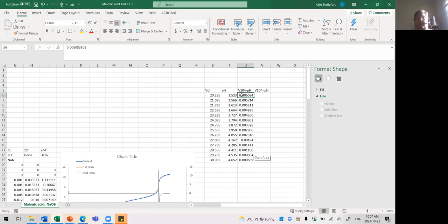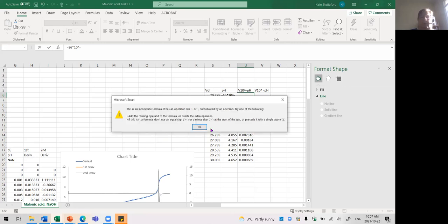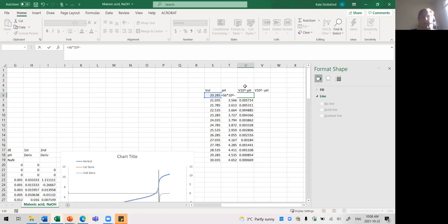Oh, I know why I have it twice. Okay, so it would be equal to this times 10 raised to the power of negative the pH. Doesn't want to let me click on pH. Yeah, okay, fine. I know you want another number in here, but you're not going to let me click. It's not happy. All right, I'll just drag that down there. Okay, there we go. And then I could drag that down all the way.